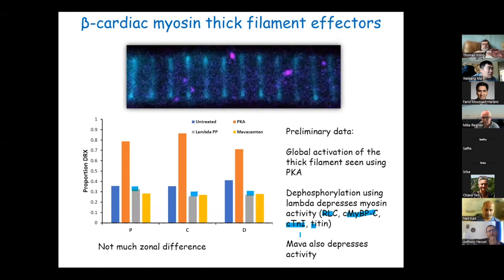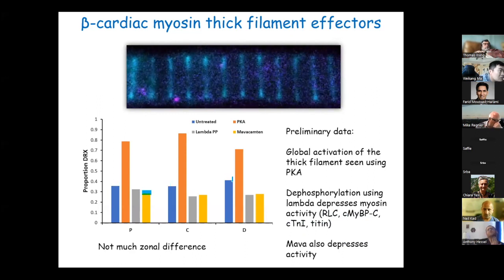And interestingly, if we then take a look at mavacamten treatment of the original untreated stuff, so we haven't added any other phosphorylation or dephosphorylation to this.